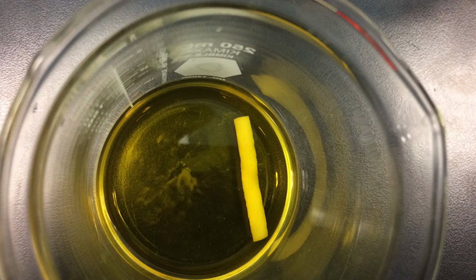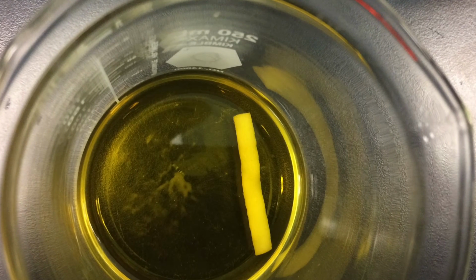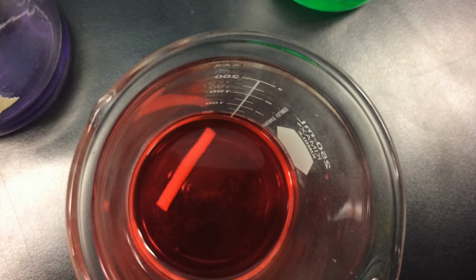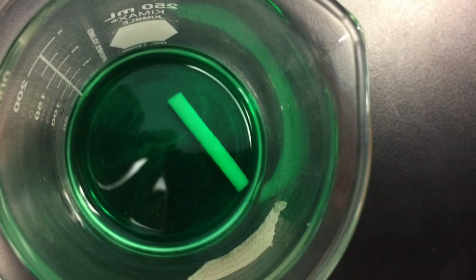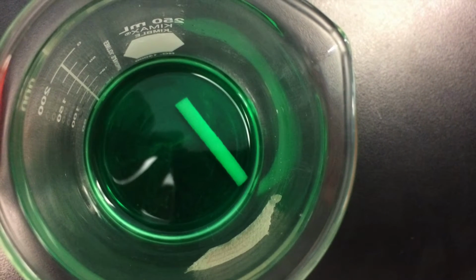Solution A lost 22.2% of its mass and 7.5% of its length. Solution B gained 22.2% more mass and gained 7.5% more length. Solution C lost 40% of its mass and 7.5% of its length. Solution D lost 22.2% of its mass and 10% of its length. Finally, solution E didn't lose any of its mass and lost 2.5% of its length.